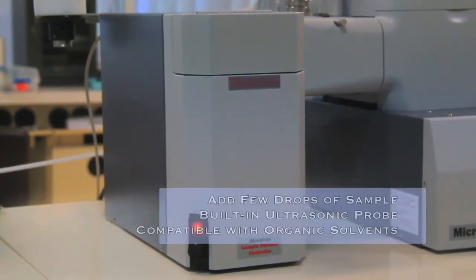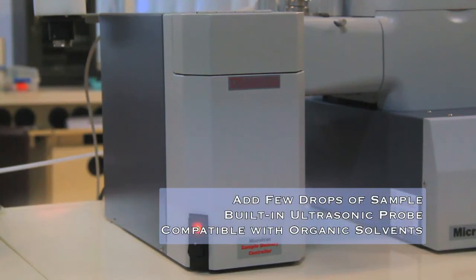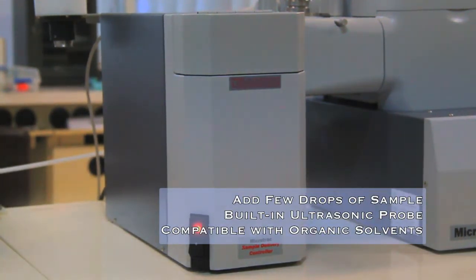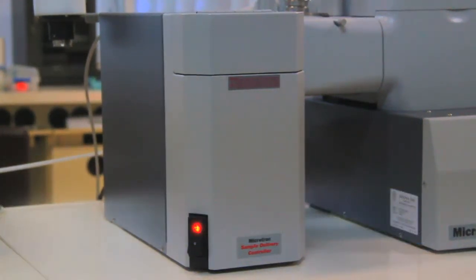A small amount of sample is introduced to the SDC whereby a built-in ultrasonic probe can be used to disperse agglomerated particles. The SDC can automatically rinse the system after the analysis. The system is compatible with DI water and most organic solvents.